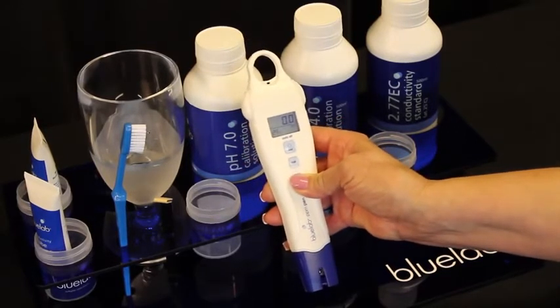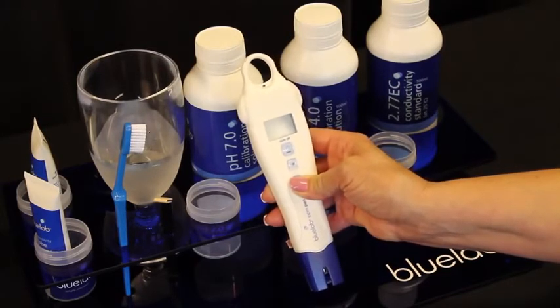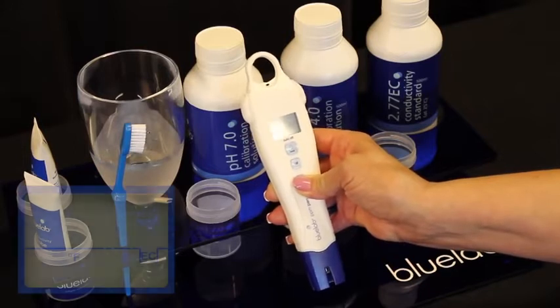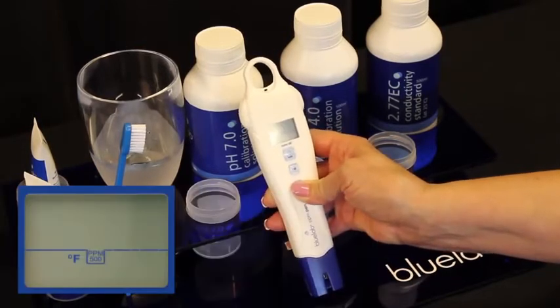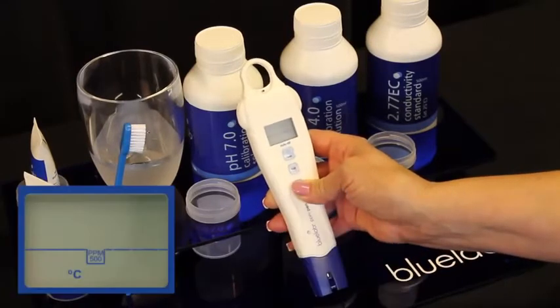By holding down the units button until the screen starts to flash, then short press the units button to cycle through your settings. You can change it from reading EC to PPM 500 or PPM 700. You can also change it from Celsius to Fahrenheit.